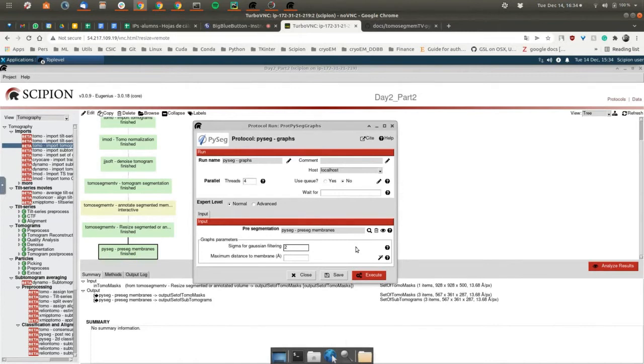Here, with this other parameter, we are going to specify how far we can go from the membrane to the outside. The final edge is the thickness of the outer or inner surroundings areas that we have determined before. Not always is the distance in a straight line.